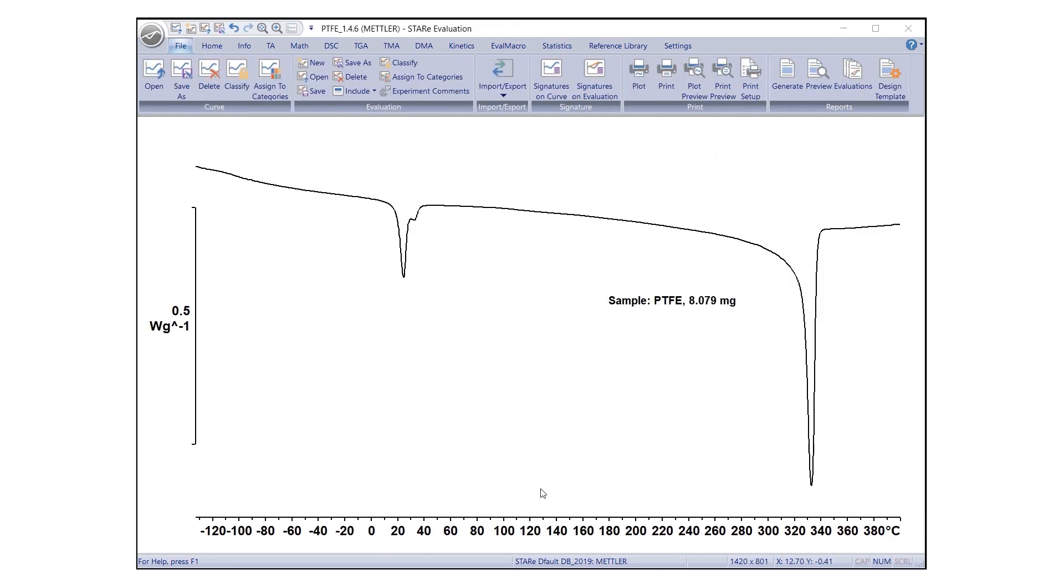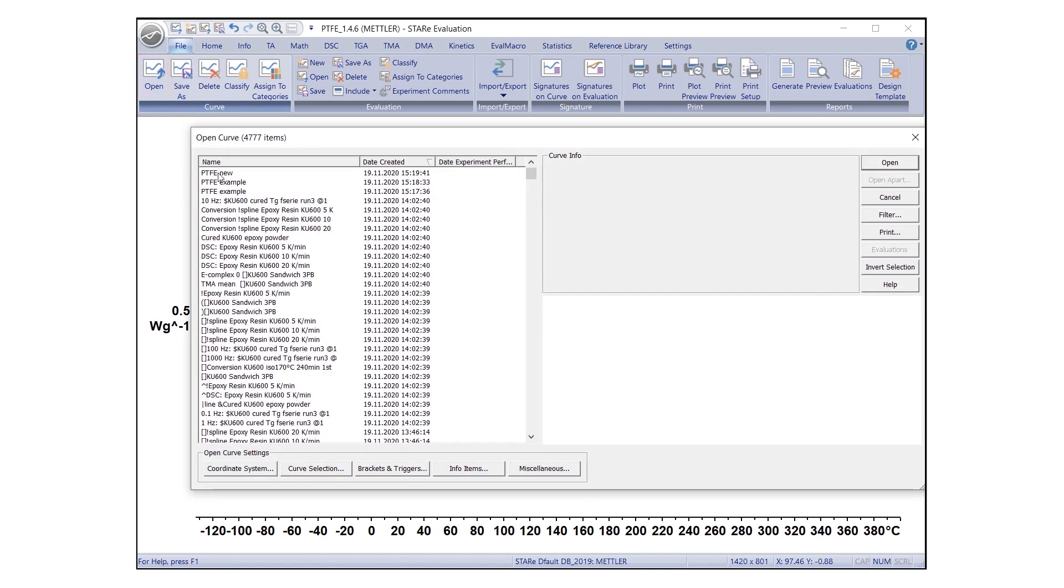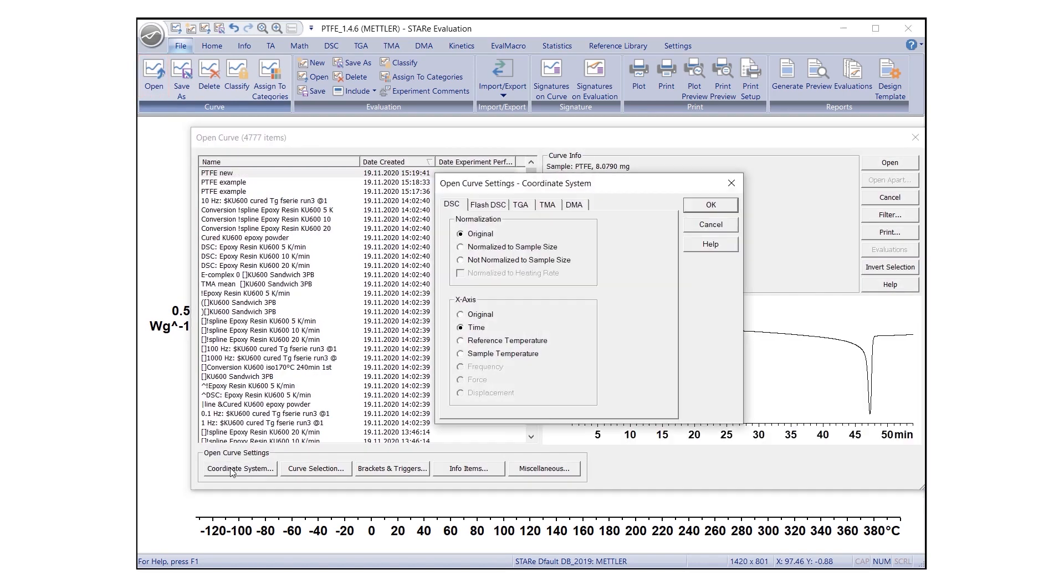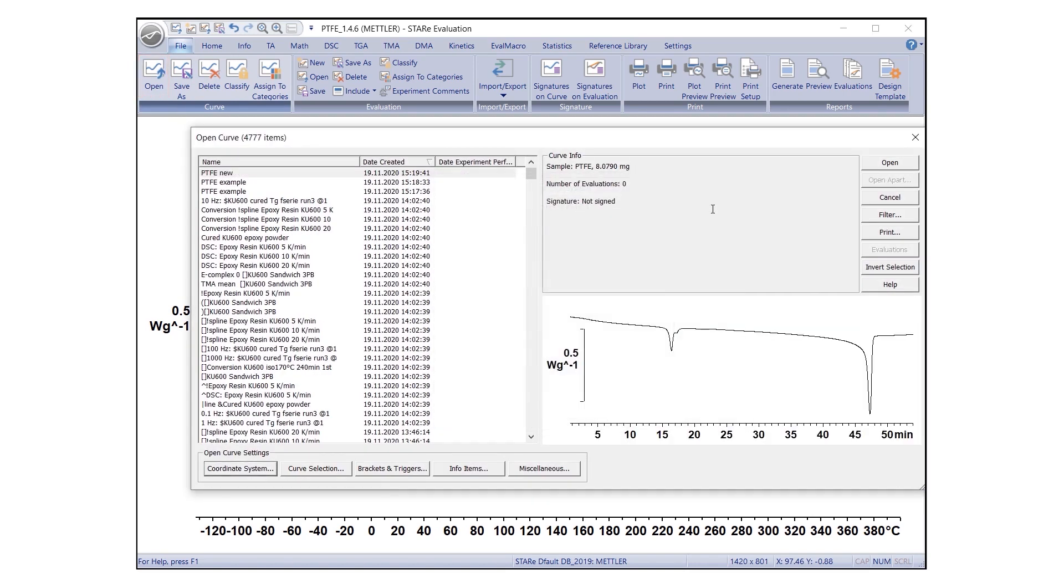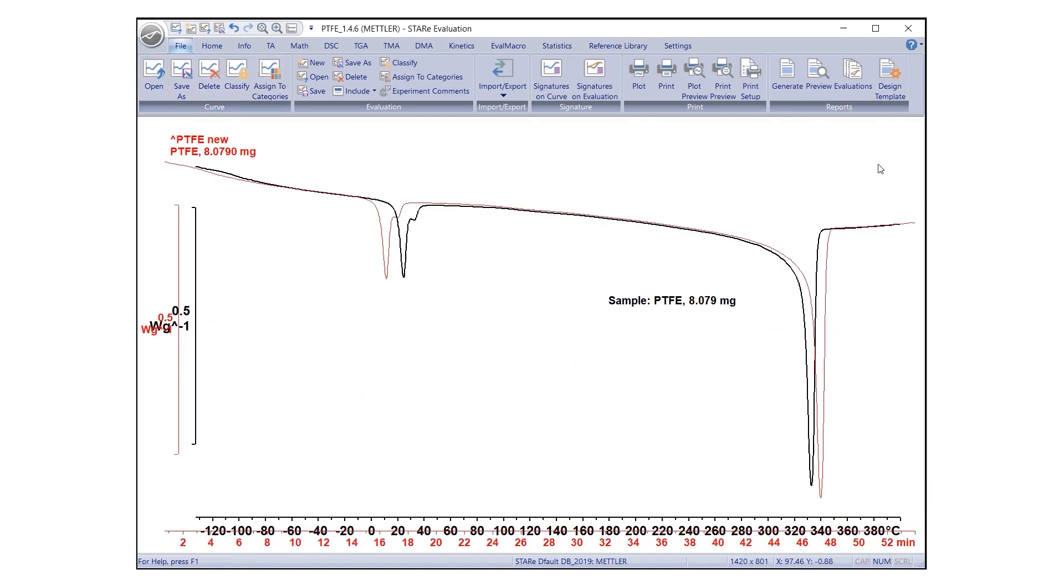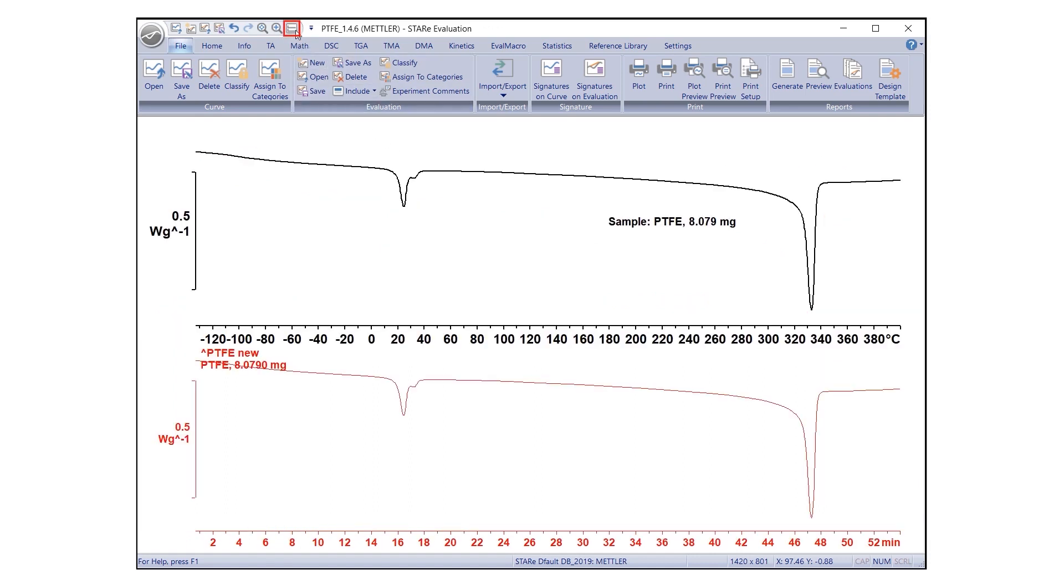You can also crop a specific area of the curve, for example, to highlight an effect. Open the same curve in a different coordinate system and arrange these curves vertically. Now, in one of the curves, draw a frame around the area of interest.